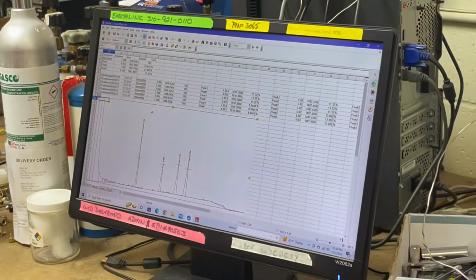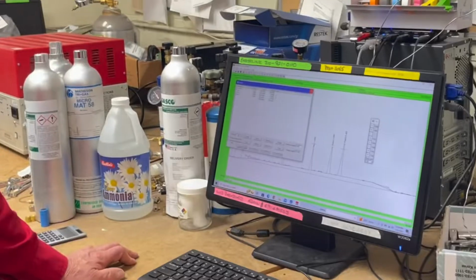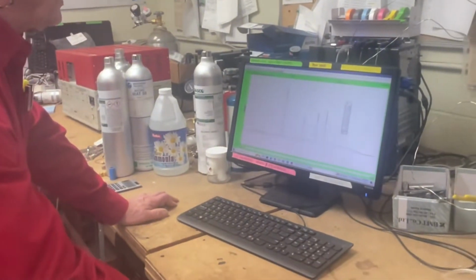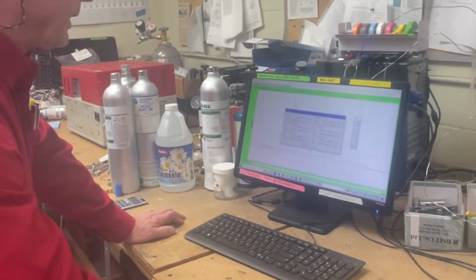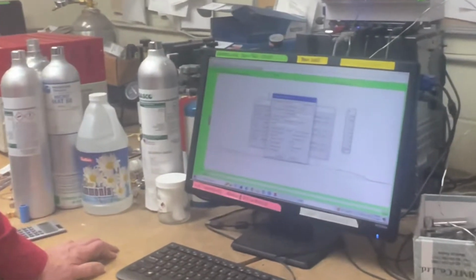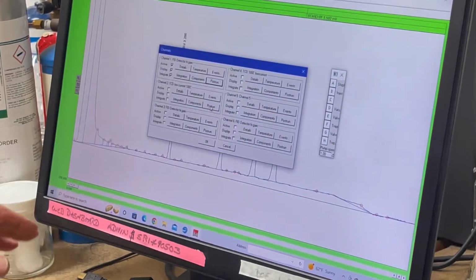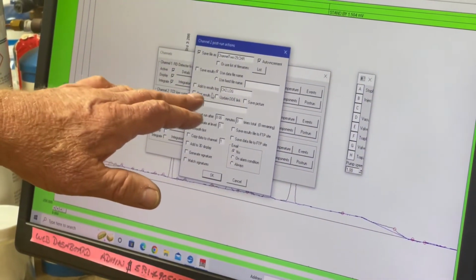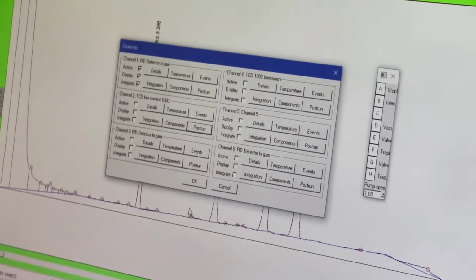So that's how you get the data out of PeakSimple and into some other program, just by copying and clicking. And the data accumulates because you go to the post-run box and you say add to results log. So if I had two channels of data, I can have a second results log named channel2.log, or as many log files as I want.